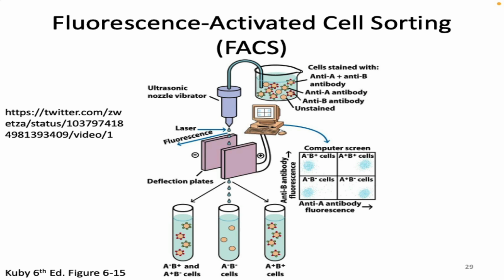Do you have a question? I was going to say, are there issues that come with that? What kind of issues? Would there be things that would affect them, like contamination? So yeah, you do. You usually do it under some special aseptic conditions to deal with the contamination, and you do have to think a lot about your experiment and what you're doing afterwards and how you want to set it up. So there's a lot of planning that goes into all of that.